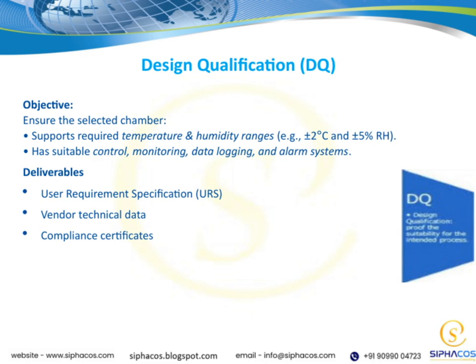Overall, the DQ process connects directly to our goal of ensuring reliable, quality testing conditions. By thoroughly defining these requirements up front, we set a solid foundation for successful qualification and operation of the chamber.